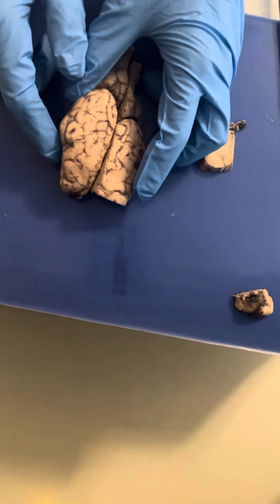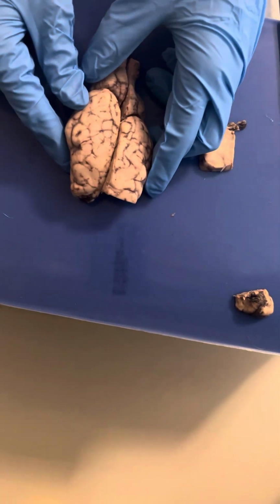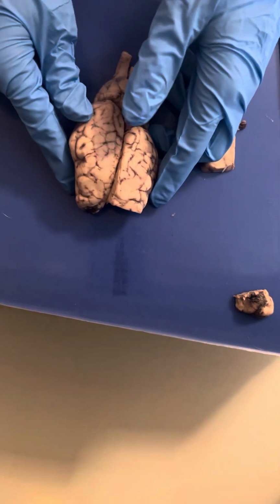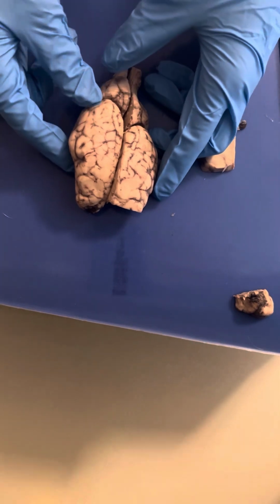Hello, this is Allison Demars, and today I'm going to be going over my sheep brain dissection for Anatomy and Physiology 220 online lab. So looking at the brain as a whole, we're going to start on the outside.